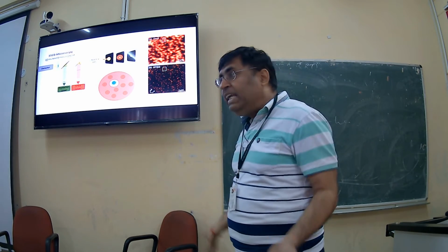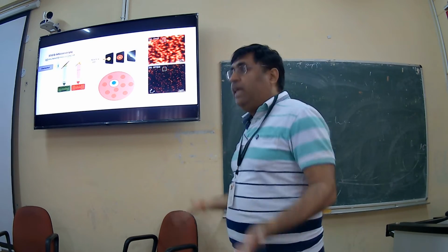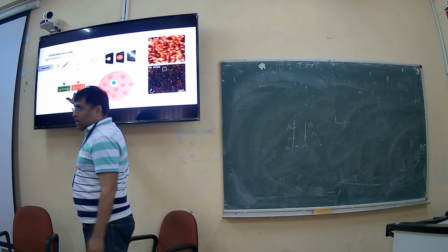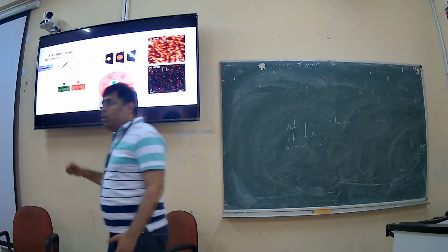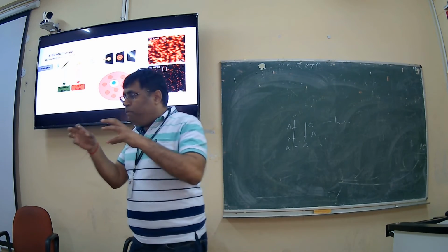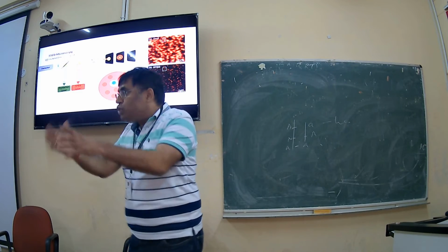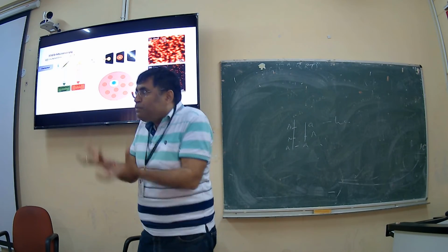Okay, so what exactly is happening? Why is this miracle happening? Because there is another laser. What will it do? For a very few seconds, it will bleach that. It will stop the signaling. It will take off its fluorescent signal.